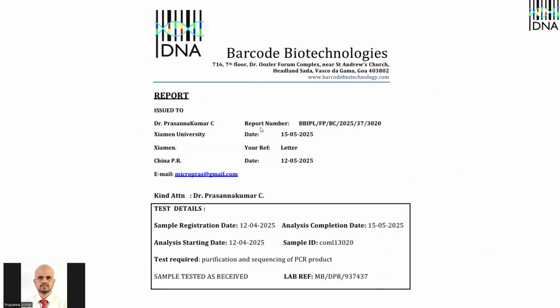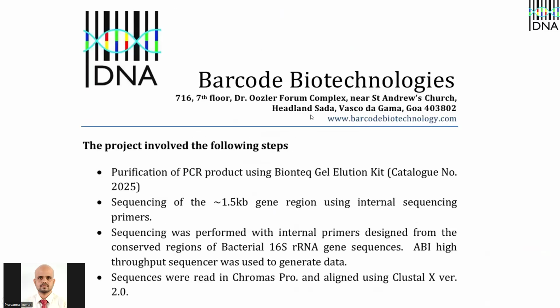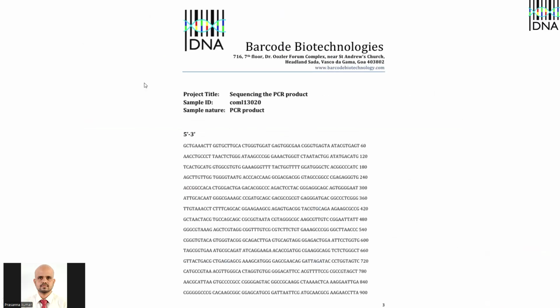This is done from the reception. They will decode it and they will give it to us. Wet lab department, once the client is submitting a bacterial sample requesting 16S, wet lab is the one who actually selects the primers and they will go for extraction, amplification and sequencing. They will prepare this file. What is this sequence and everything about. And finally, the bioinformatics department, after combining and doing the analysis, you have to put the sequence here.